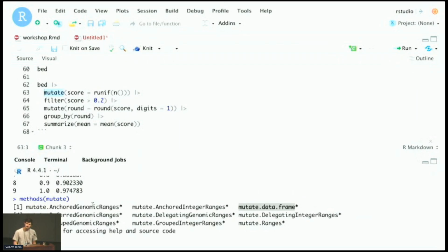So I had a related question. Bioconductor already has something that's kind of like a grouped GRanges, the GRangesList. How does that relate to using group by here on the GRanges? Oh, I actually don't know. I wouldn't know. I don't know if any of the plyranges developers are around, to have just functionality for converting back and forth between grouped genomic ranges and GRangesList. It's a fair point. So I actually don't know if that would work.